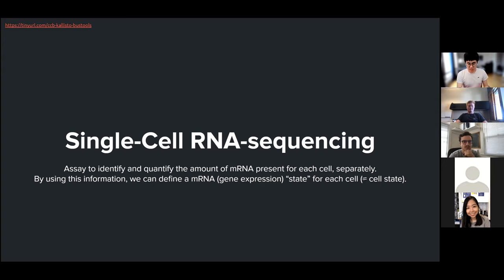And what this eventually boils down to is that we can define a particular cell state for each cell, and say, oh, these particular groups of cells represent T cells or some type of immune cells, or are in a developmental pathway.